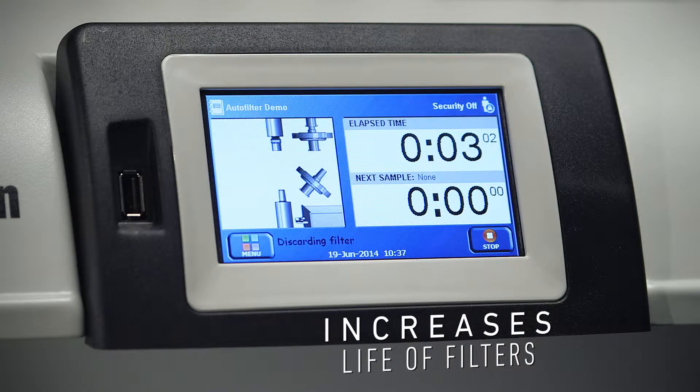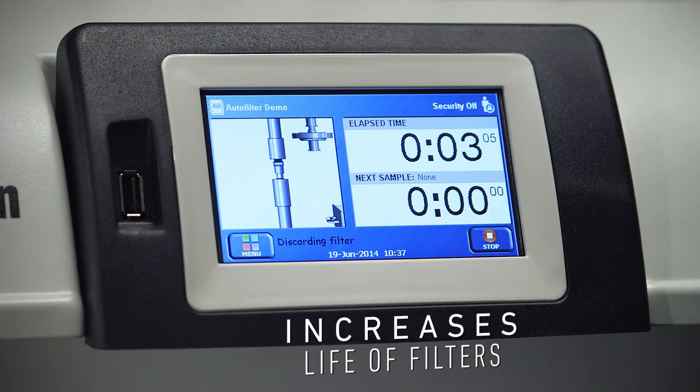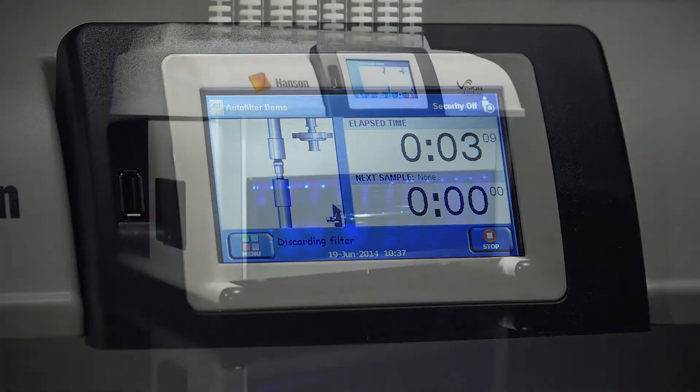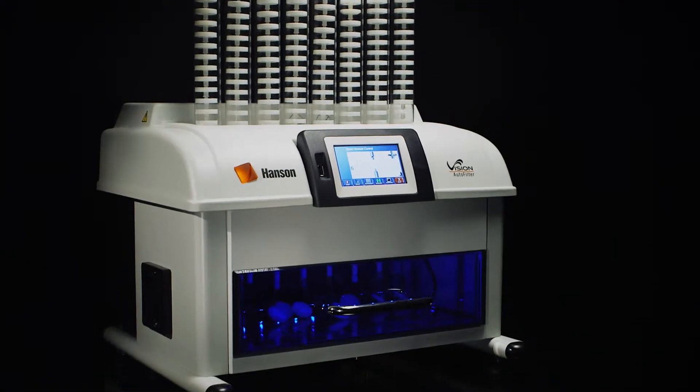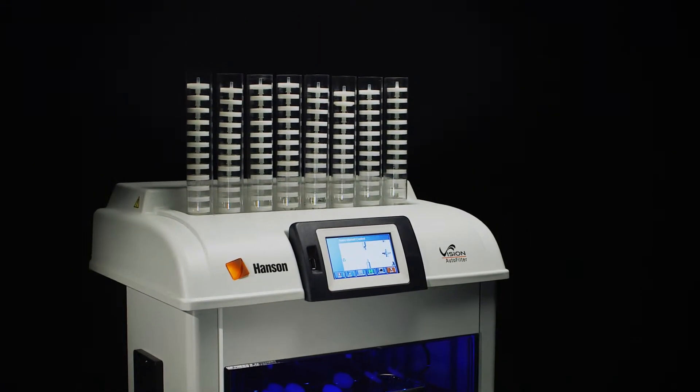Supported membrane types include PTFE, PVDF, nylon, and glass fiber membranes. If your method doesn't require the filtration of samples, simply program a filter list protocol, which will remove the filters from the fluidic path without the need to reroute any tubing.